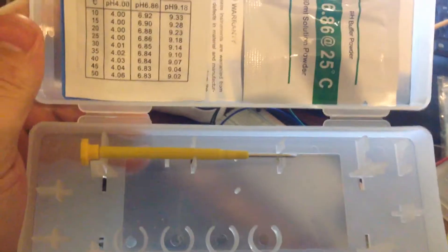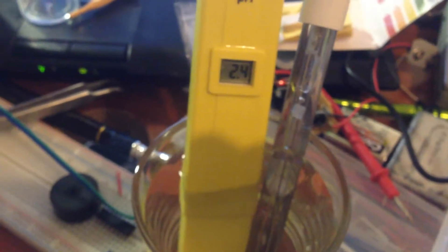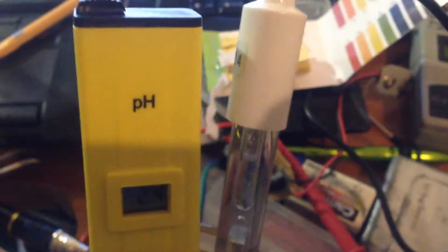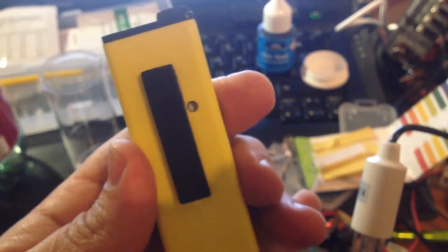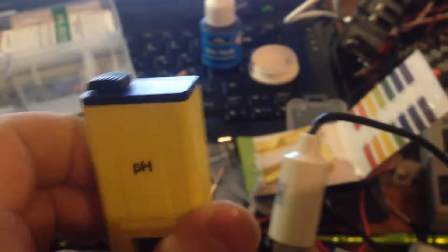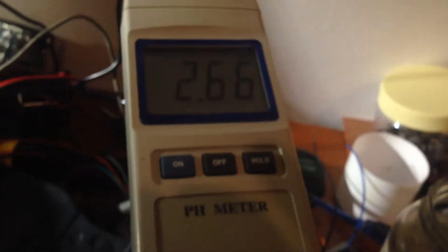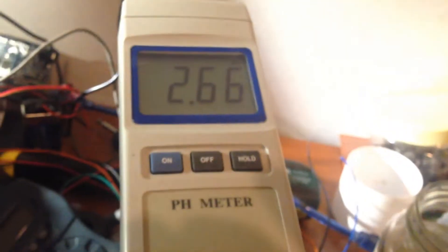This non-calibrated pH tester came with one screwdriver like this and two pH alignment powders. I did not use these two, but this is a screwdriver I tried to align the potentiometer on the back side of this pH tester like here exactly. My Voltcraft advanced pH tester will show 2.66 and this one will show 2.4.